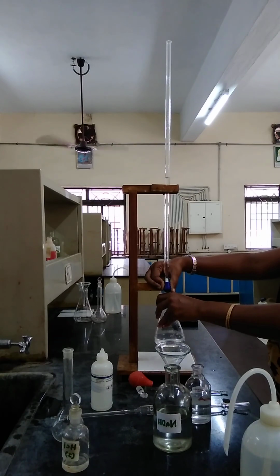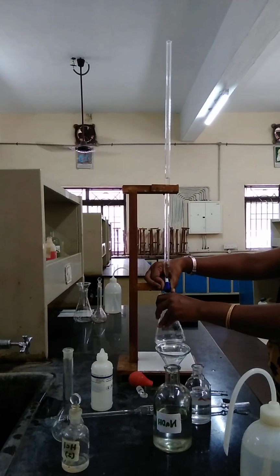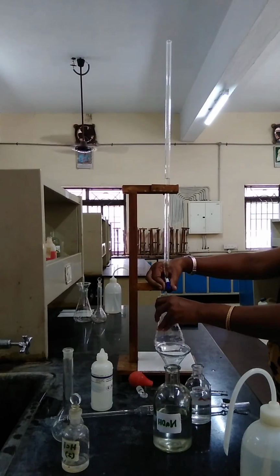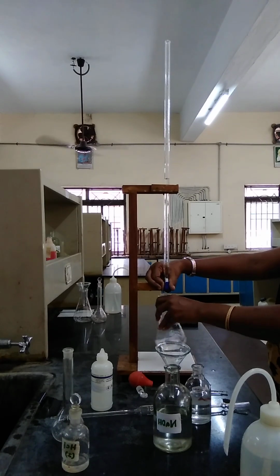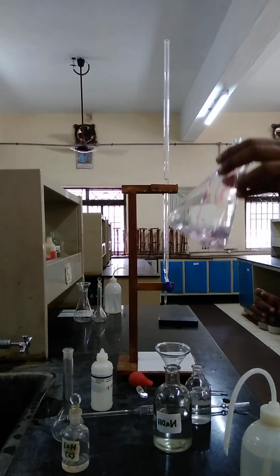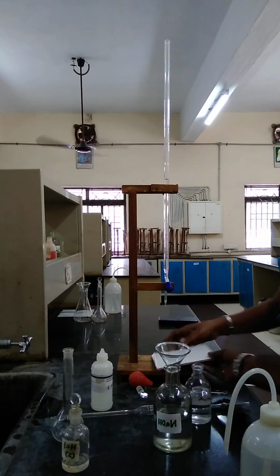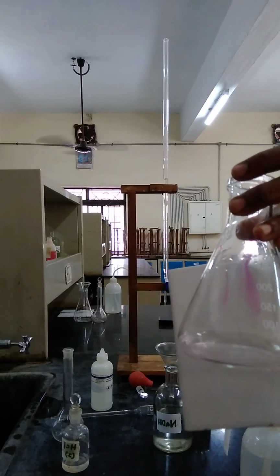Whatever the end point, we already know it is down at 25.5, right? Once we get the permanent pink, we'll stop the titration. Yes, it started to appear as permanent pink. Very clearly we got the permanent pink. You can see the pink color.